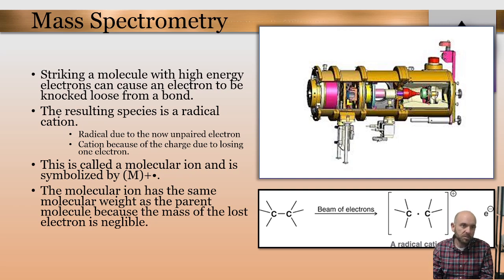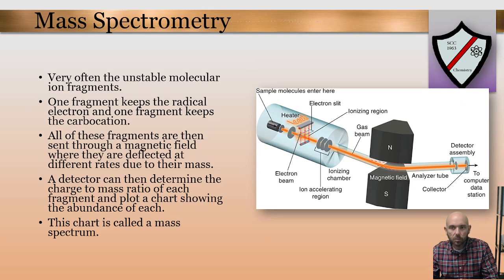And then the other species is a radical species, and while it's neutral, it's still a radical because it's a carbon with three bonds and just one electron that's not bonded into anything. That's not a very stable state for carbon. That's considered a radical, and so we'll take a look at that.